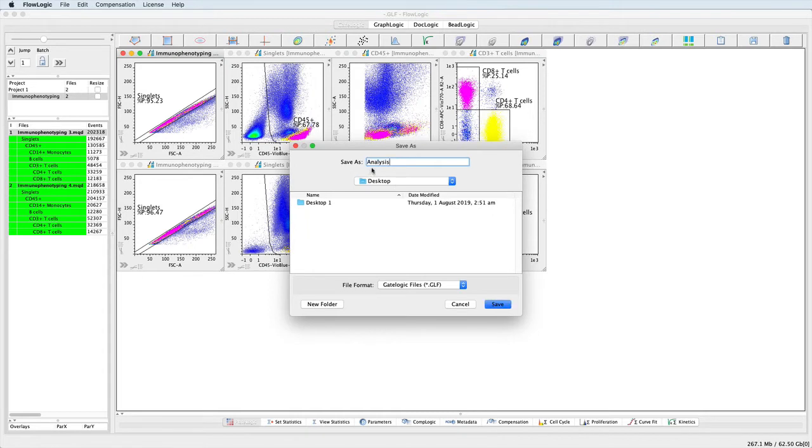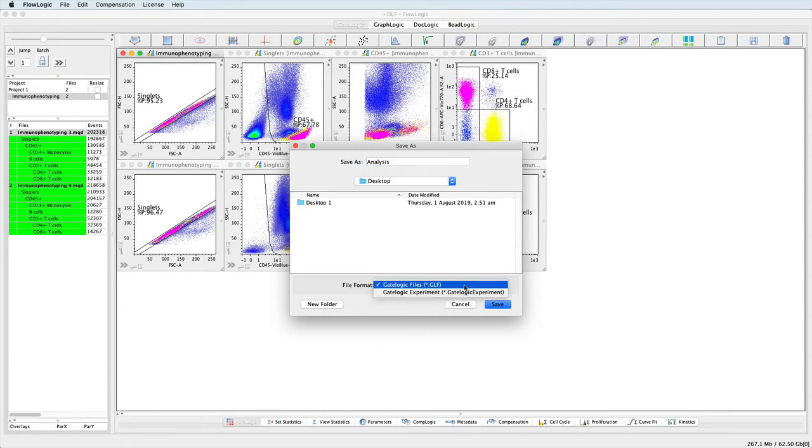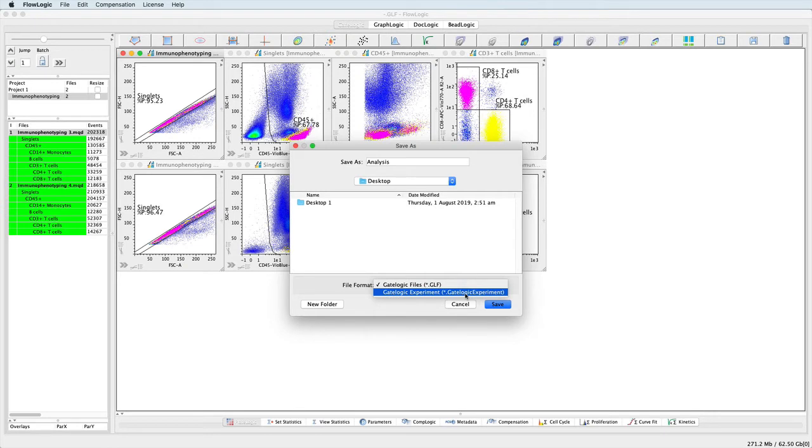Choose the file format, being either the .glf, which stands for GateLogic file, or the .GateLogicExperiment.